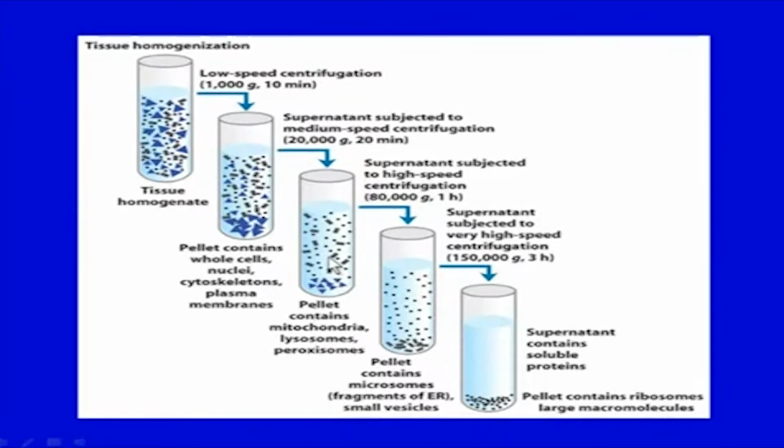So, this was the largest one and now medium sized particles are being pelleted here. Again you will get a pellet, which will be only partially pure.